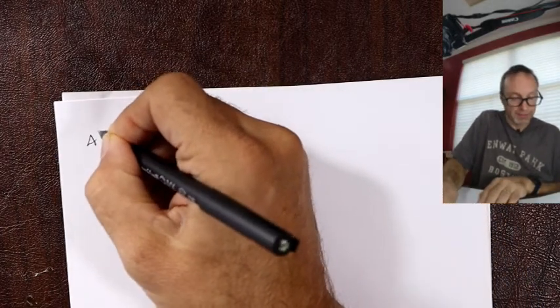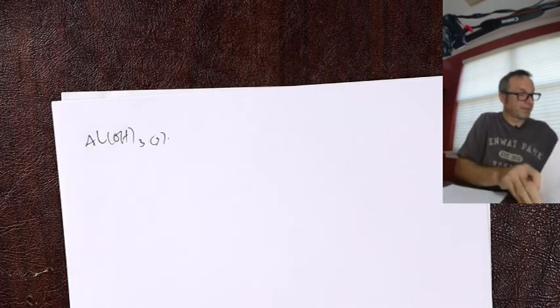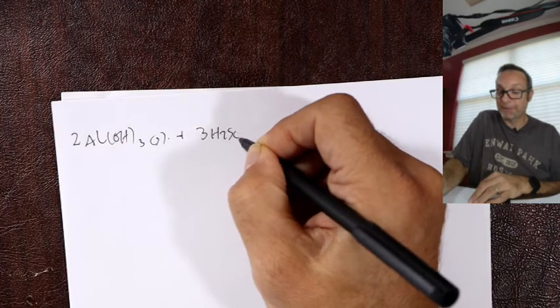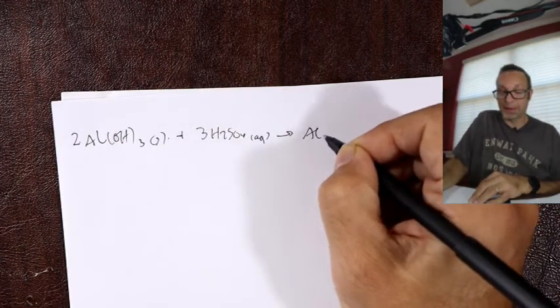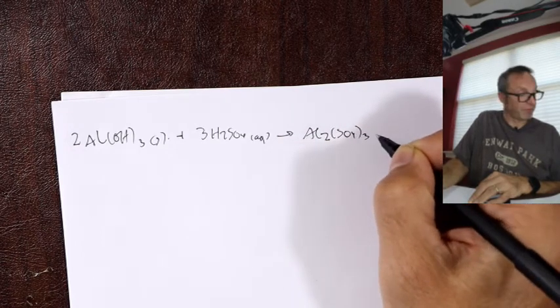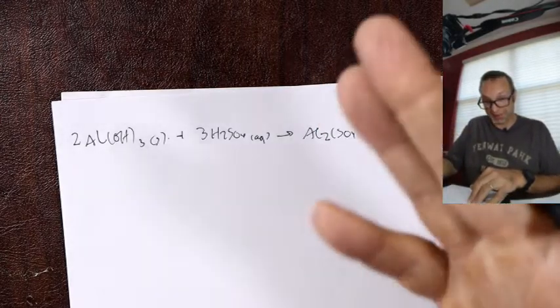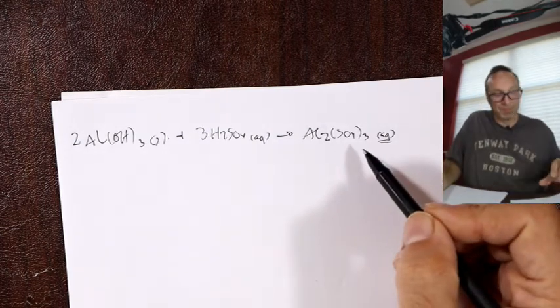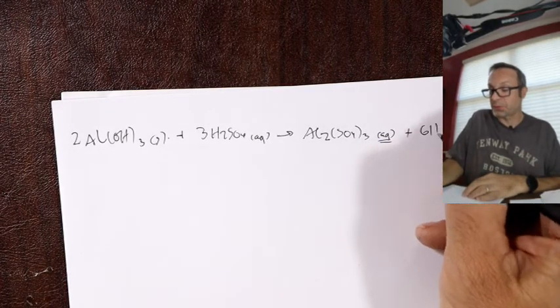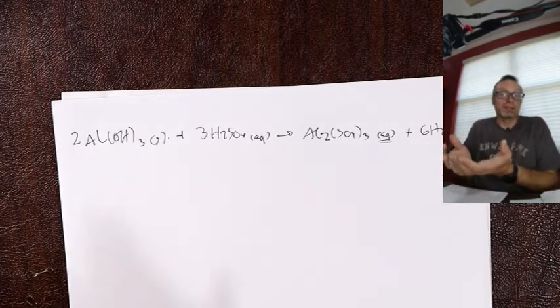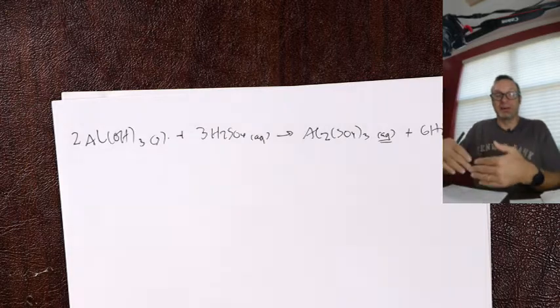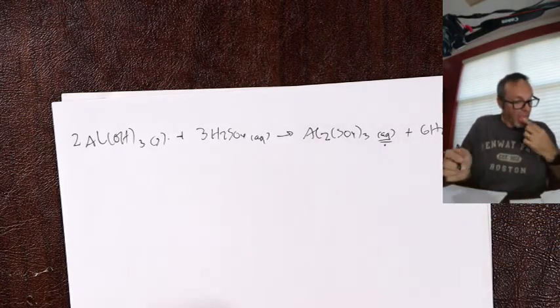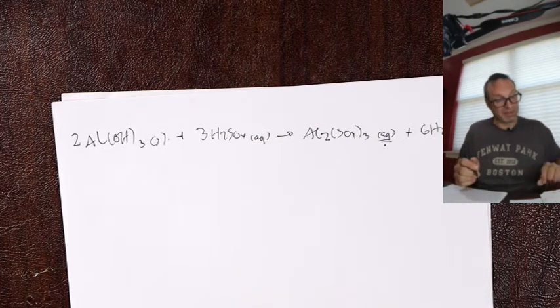We're going to add this in great excess and it's very interesting what happens. This aluminum hydroxide solid reacted with the excess sulfuric acid turns into Al2(SO4)3 aluminum sulfate aqueous plus 6H2O. So it disappears, reappears, and disappears again - it went from solid to aqueous, solid to aqueous. We have this beaker sitting on our desk and we're adding reagents and stirring, and it kind of disappears, reappears, disappears. It's just changing its formula as it does so. Now it's in the disappeared state but we're nearly there.